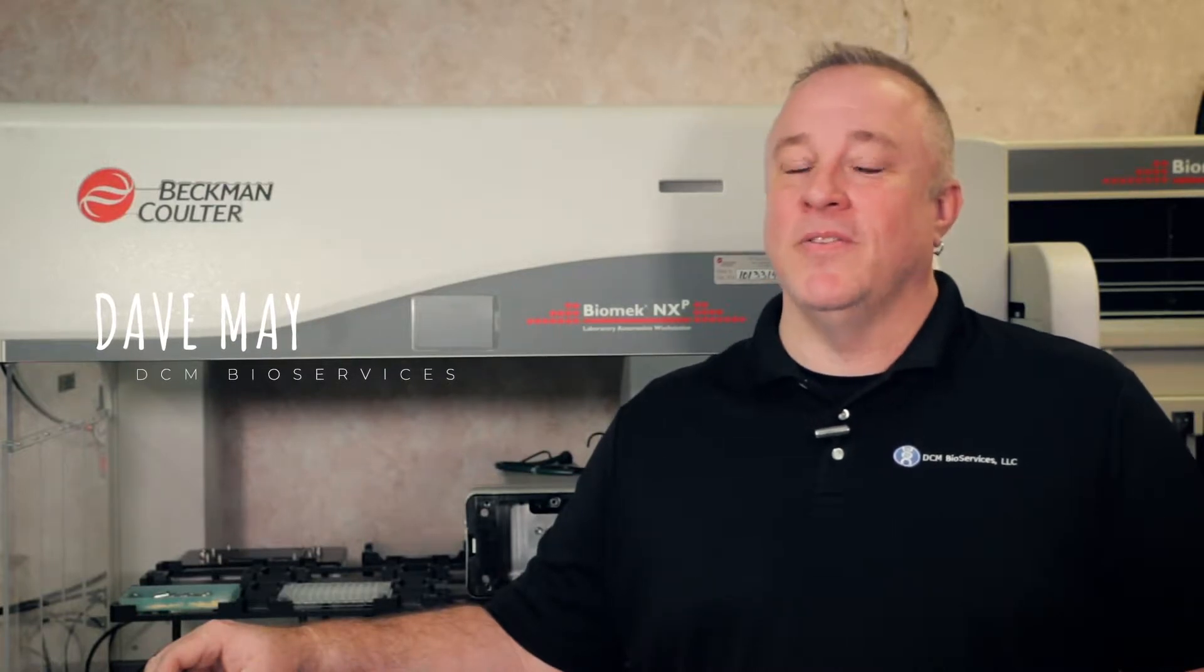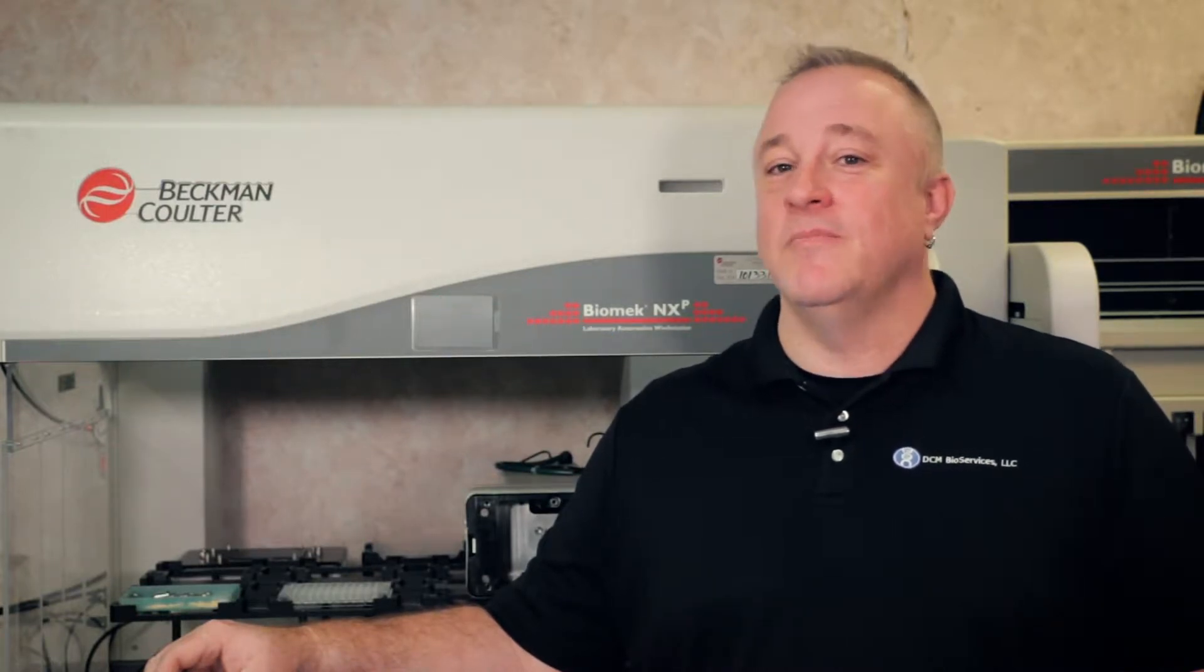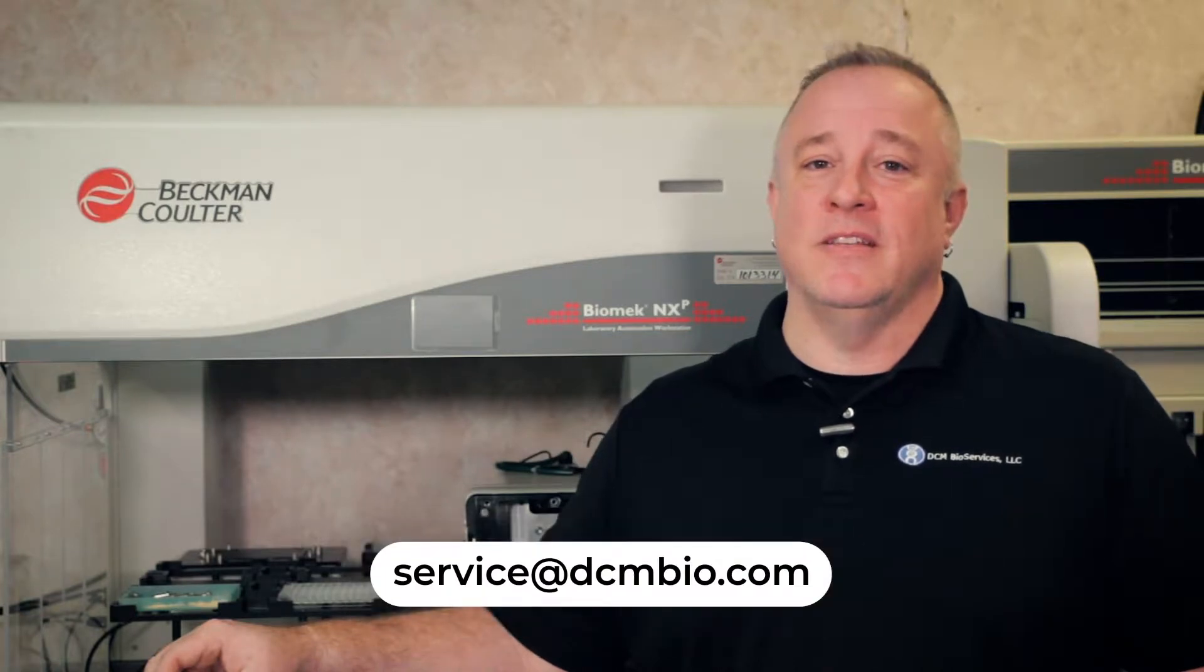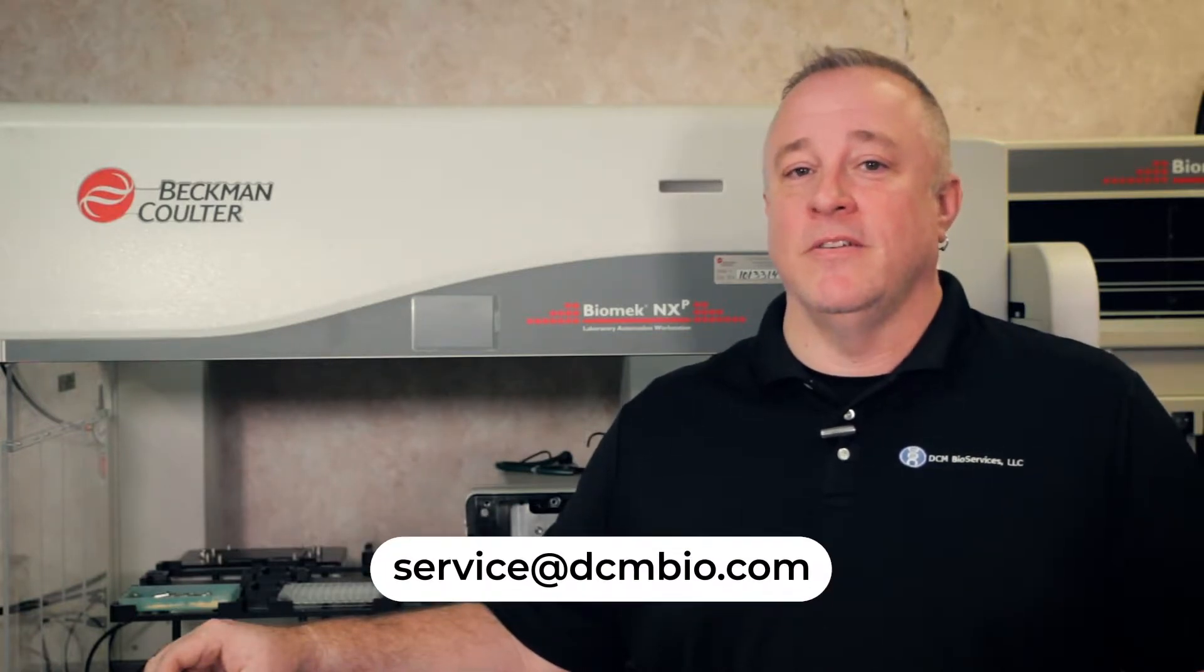Today, we're going to go over how to change the barrels on an Agilent Velocity 11 multi-channel head. As always, if you don't feel comfortable performing any of these steps, please feel free to reach out to us at service at DCMBio.com and we'll be happy to assist you.